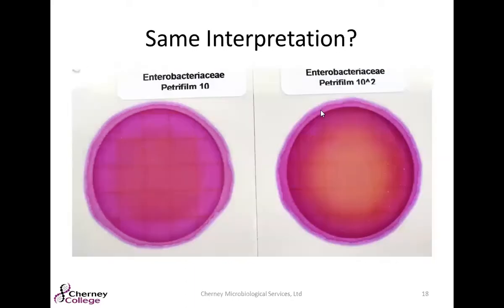Taking it one step further, if I add in a 100 dilution, I'm going to relaunch the poll and see if any of your interpretations might have changed. All right, so I see a lot of you have switched over from no growth present to too numerous to count. And that really just shows how important that extra dilution is.